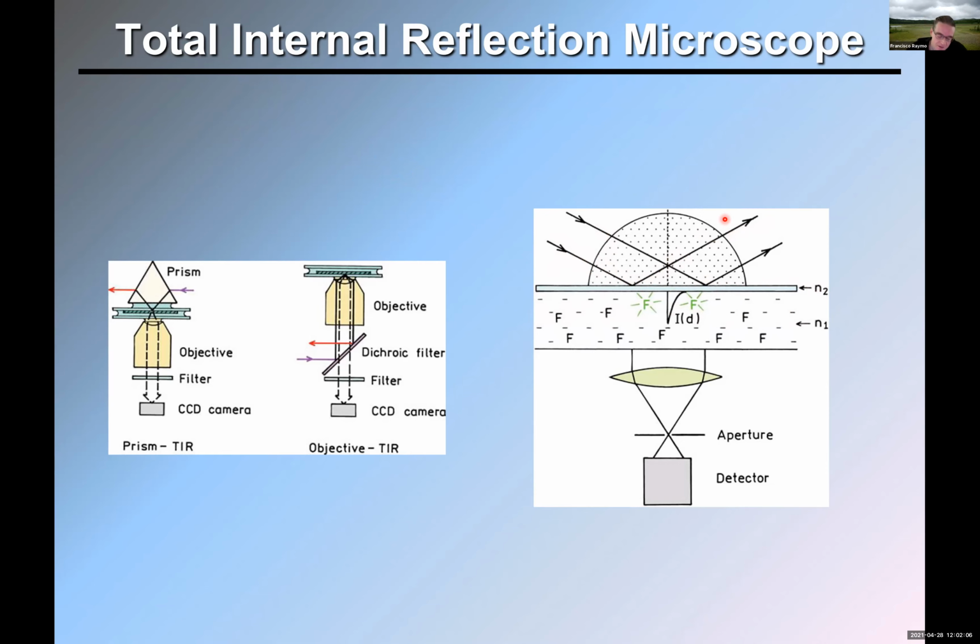But I'm not sure if you know what the evanescent field is, but let's say there is a little bit of light that is very close to the surface of the glass slide, but on this side, which is represented by this plot over here. So this is representing, it's upside down, the intensity of the electromagnetic field against distance. So within the first 200 nanometers, there is some light in here, okay? Beyond that, there is no light.